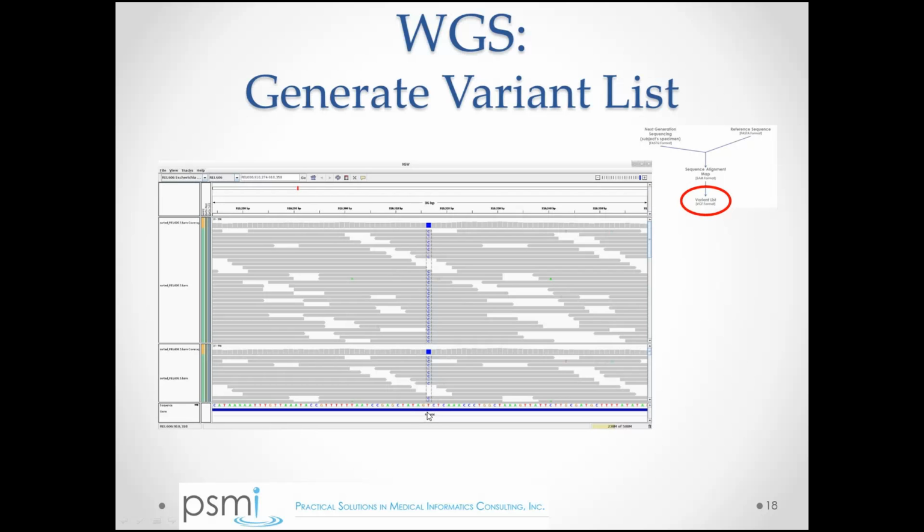And I think you can understand how it would be possible for a software algorithm to infer from this, okay, the individual whose DNA we're analyzing obviously has a SNP, has a polymorphism or has a variant at this particular locus.